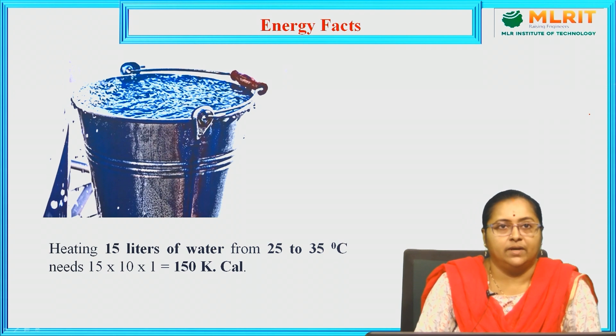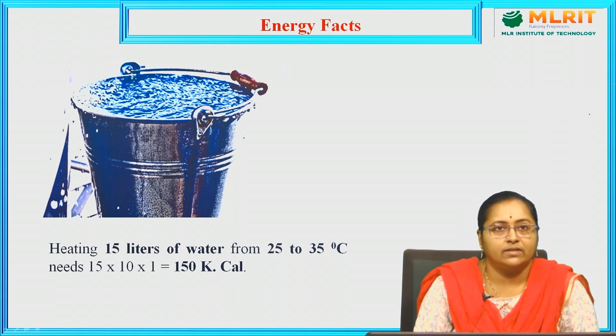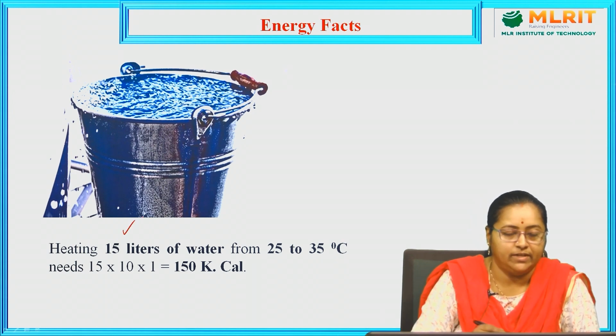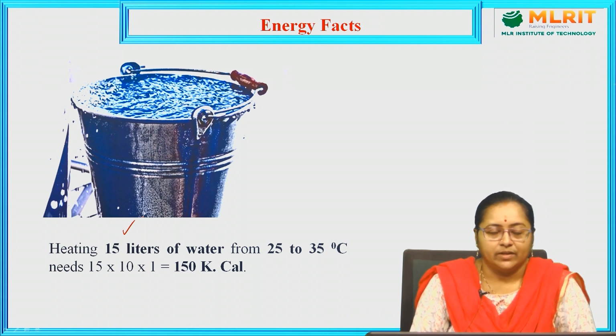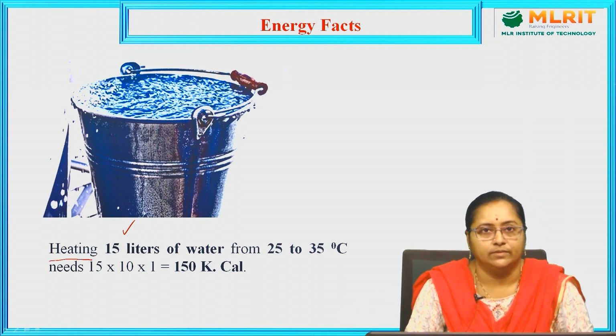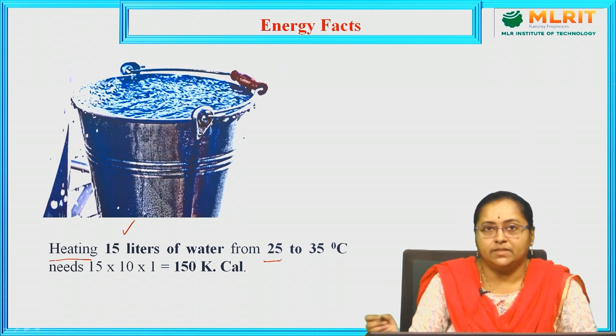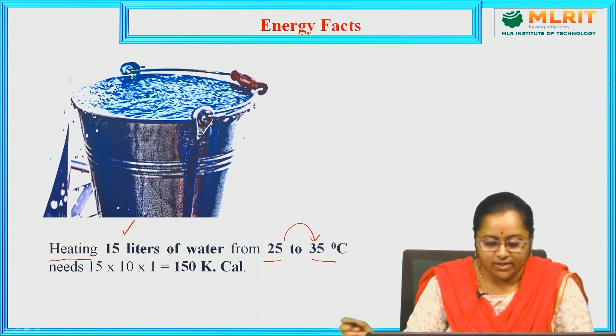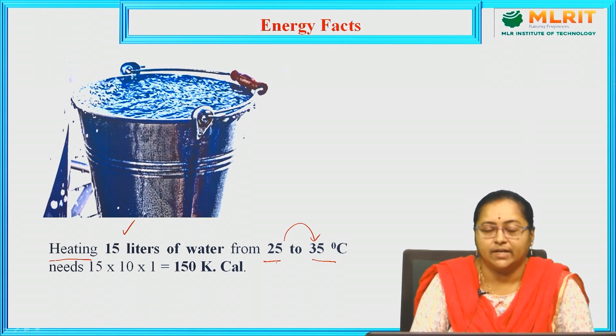See, this is a bucket full of water. That means a bucket that is filled with water. I just want to heat this, and the capacity of that bucket is 15 liters of water. Now what I am going to do is heat that 15 liters of water. Initially it is at room temperature, that is 25 degrees centigrade. I just want to increase the temperature by 10 degrees centigrade, that is up to 35 degrees centigrade.